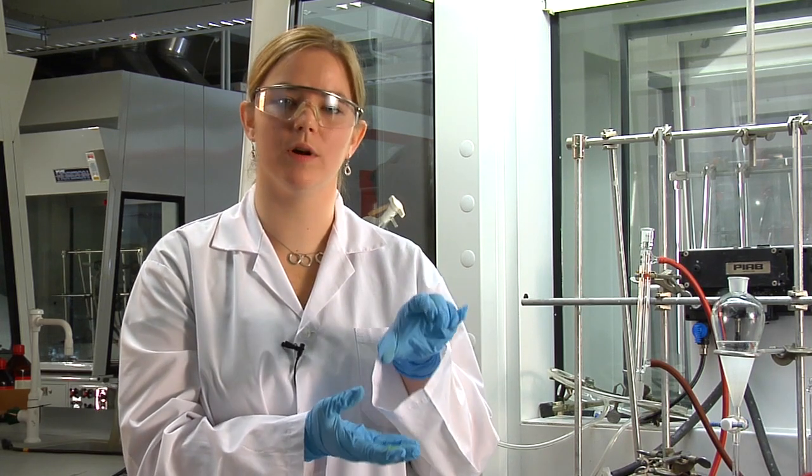So once you've had your water added to the ether phase, you're going to do your first extraction. Then you're going to do another extraction with 25 mils of water again. And then 2 more washes of 25 mils of 5% sodium bicarbonate. And then for a final wash, you're going to add 50 mils of the saturated sodium chloride solution. So each of these washes, you're going to be removing the aqueous phase and saving the organic layer, because that's where your product is.